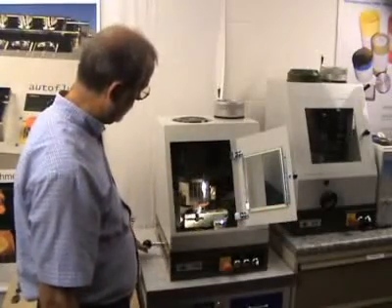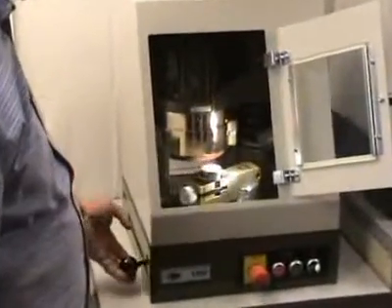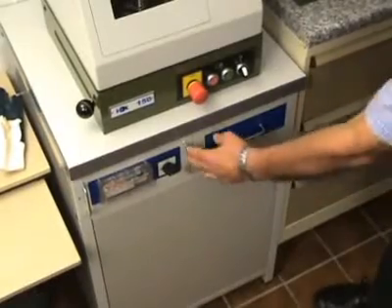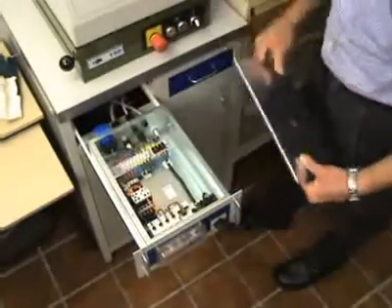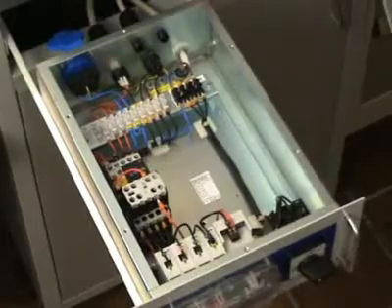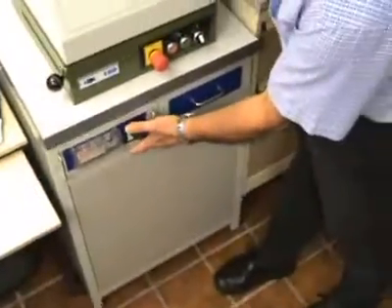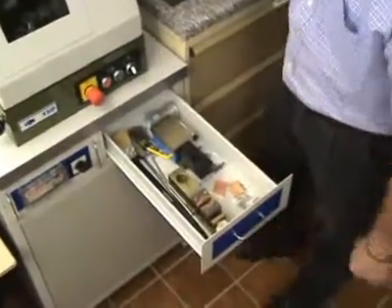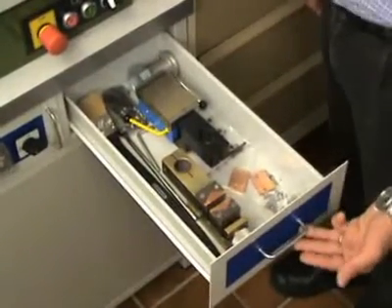The sample is fixed in a vise and moved under the grinding stone. The machine switchboard is placed in the upper left steel cabinet. On the right side is a drawer which takes the tools and special vices and magnetic plate.